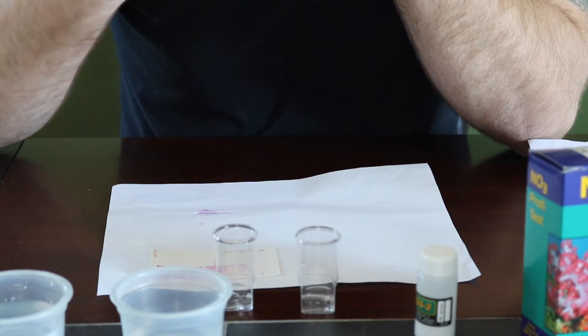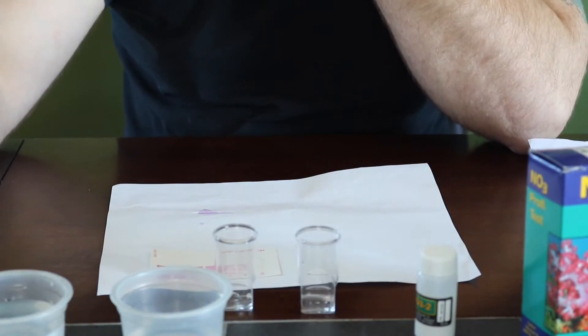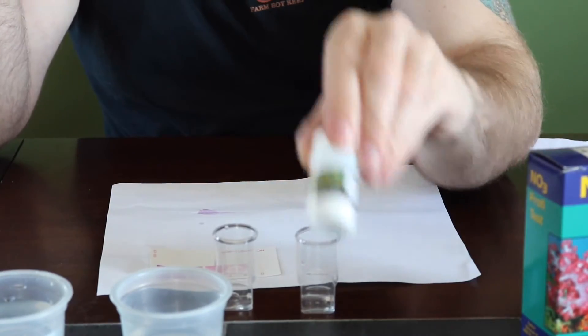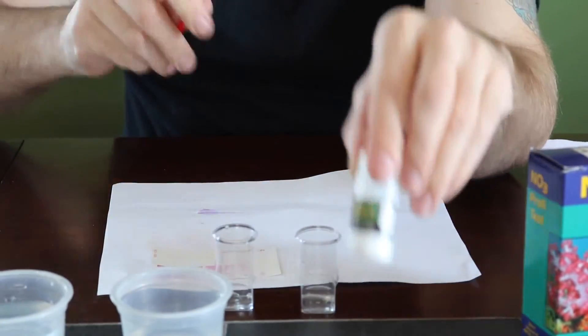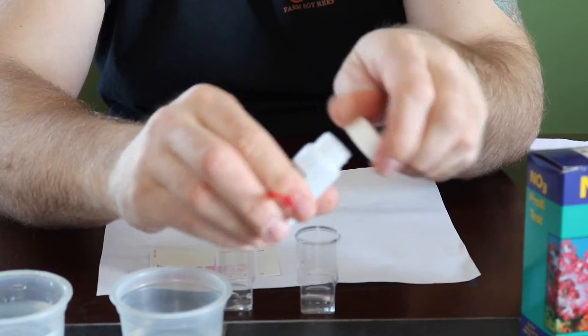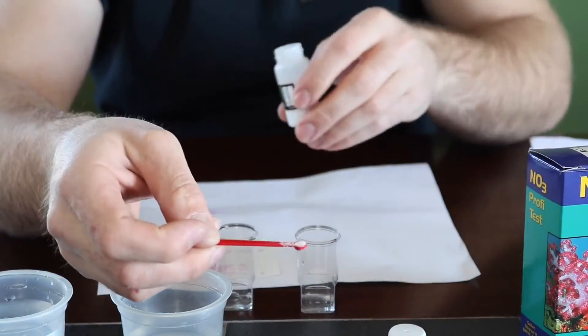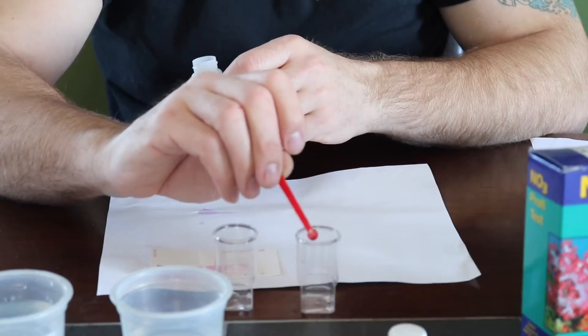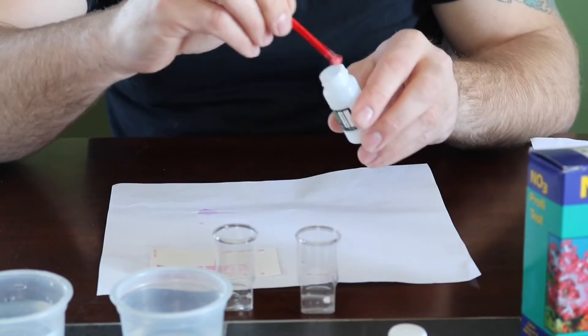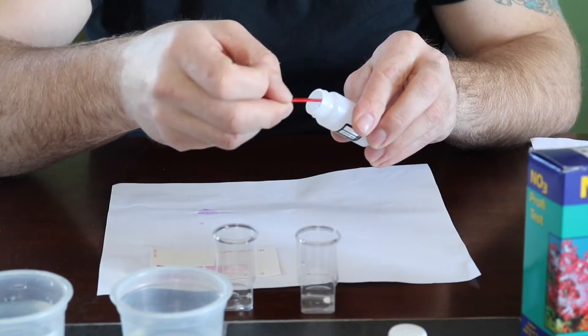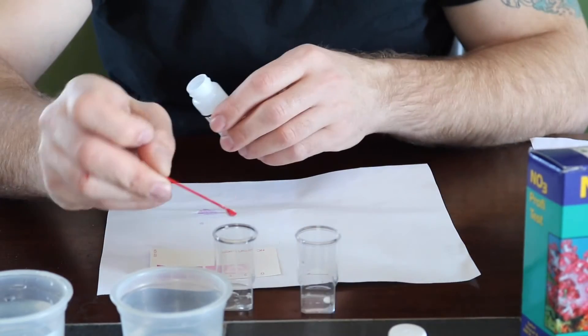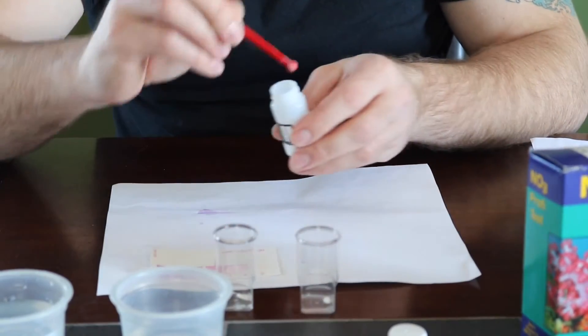So what we need to do now, we don't shake it right now. What we're going to do is we have to take the NO3-2 powder and our little spoon and we need to put one each in each test vial. So just make sure it's level. So you guys see how that's nice and level. So we add that to the first one. Don't shake it yet. And let's do the other sample. Make sure it's level. Just like that.